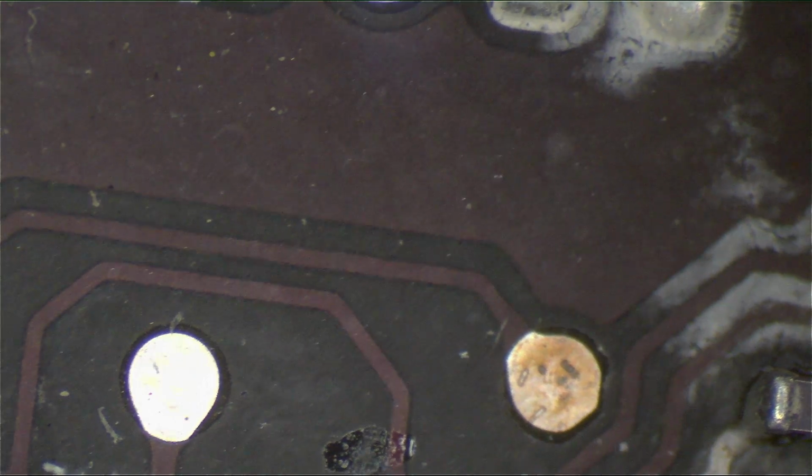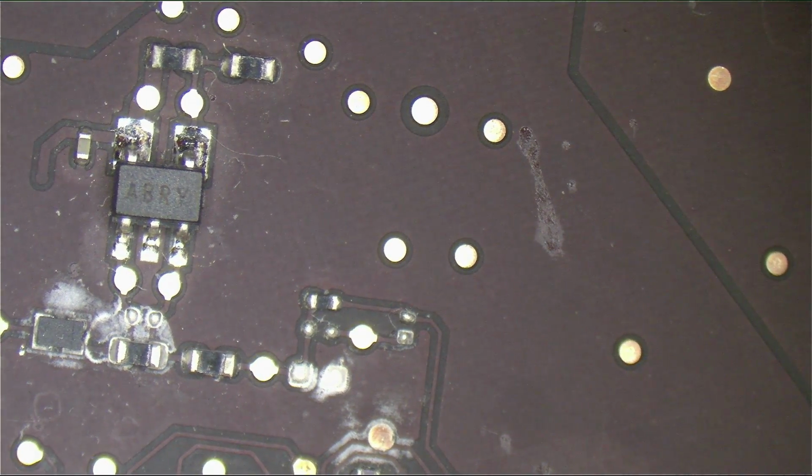It's ridiculous. Whereas again, when you move up to the $300 to $600 microscopes, you can see as I zoom, you still have that clear picture. You still have the same resolution, it's the same size, and it's great. So I like having adjustable zoom.